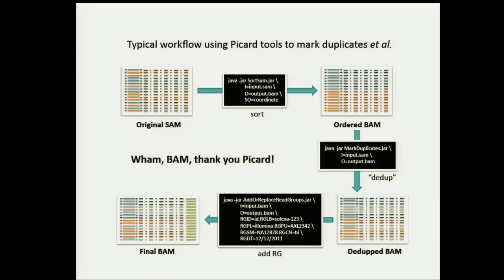I have a question on the read group. Typically, we get a BAM for each sample. So when you talk about the read groups, do you mean that you actually have to introduce them? Why do we need to do the read group thing if we typically get one BAM per sample? The sample is a big part of the importance of the read group. There is other information in there that is also very important, like which run of the machine was this? Which platform did it come from? Is it PacBio? Is it Illumina? Is it Ion Torrent?